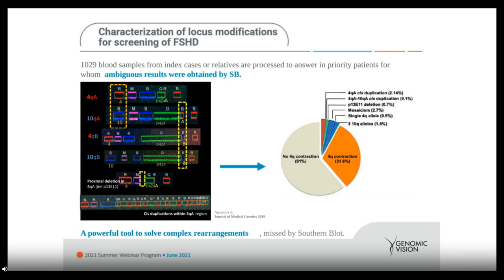Here, as you can see, this is a real picture of a combing experiment: red, green, magenta, blue is chromosome 4, and blue, magenta, blue is chromosome 10. You can already see the D4Z4 and the length that we are speaking about. At the end, you see the red dots to distinguish haplotype A, while below you have the blue dots for haplotype B, and the red tract at the end tells us that this is an intact signal.